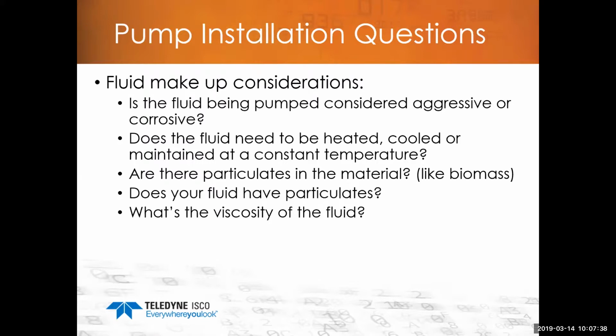You want to make sure that if the fluid you're using is aggressive or corrosive, it doesn't cause any leakage or any seeping from the metal into the material and thereby contaminating your sample.